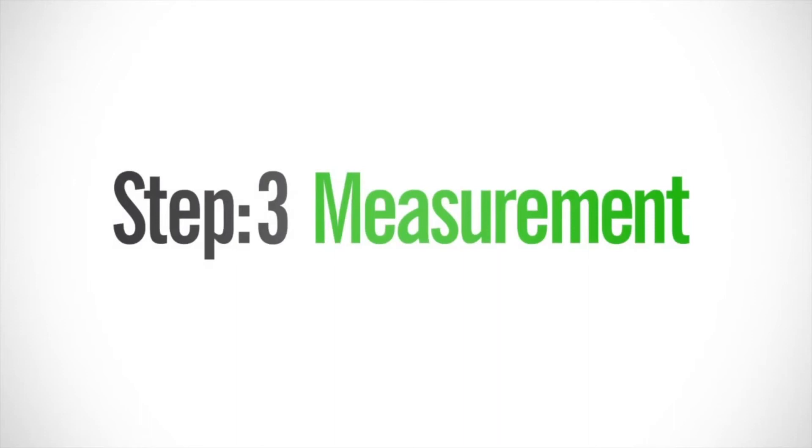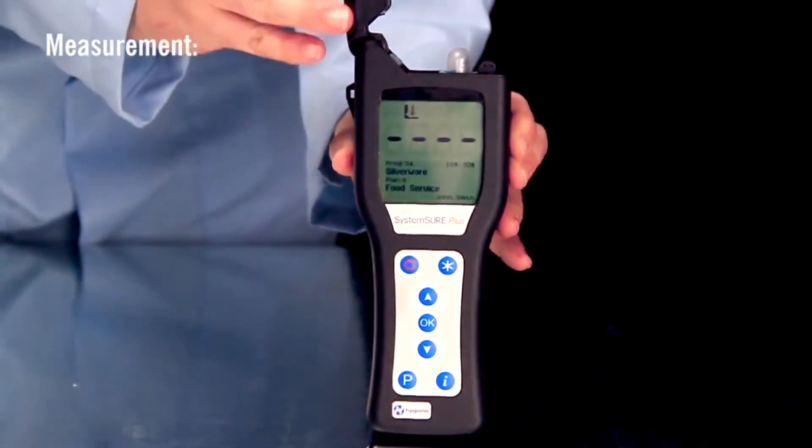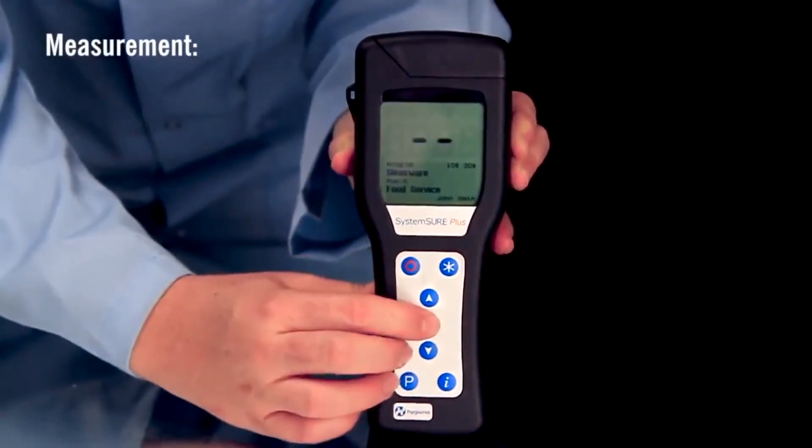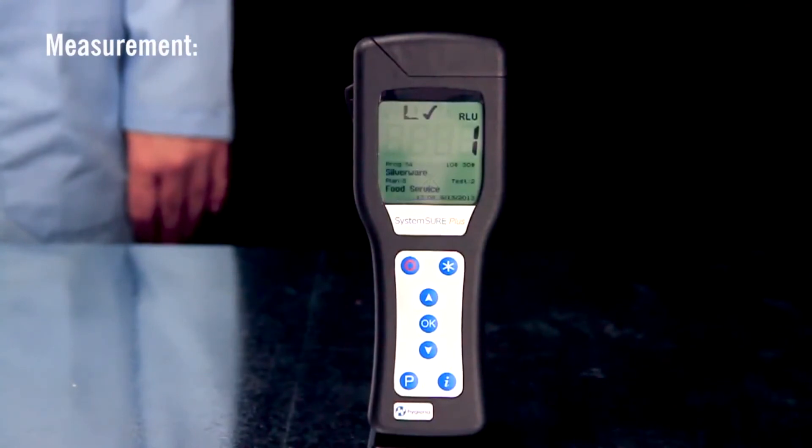The final step is measurement. Insert the test into the read chamber and close the lid. Holding the luminometer upright, press OK to initiate measurement. Results will be displayed in 15 seconds.